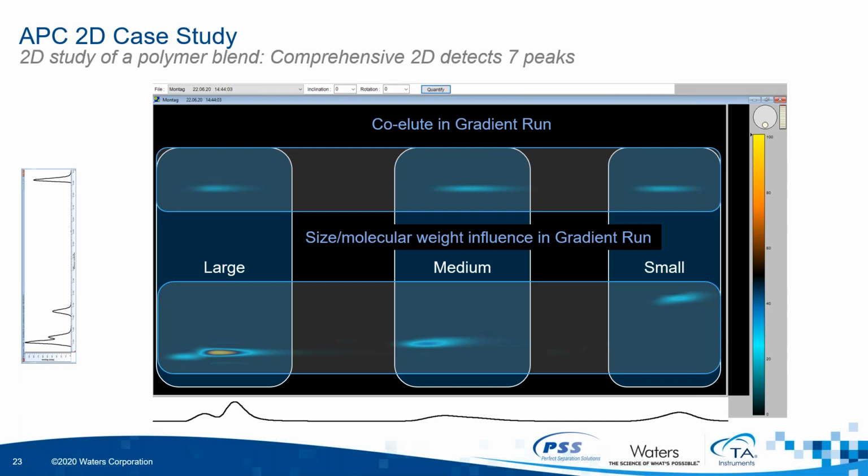So polystyrene and polymethyl methacrylate of similar hydrodynamic volume coelute in the SEC run by itself. The horizontal boxes show a separation by chemistry. There is an excellent separation between the two chemistries. Since the polystyrene samples are not on the same level as the PMMA samples, it can be reckoned that a slight molecular weight influence was occurring during this gradient separation.